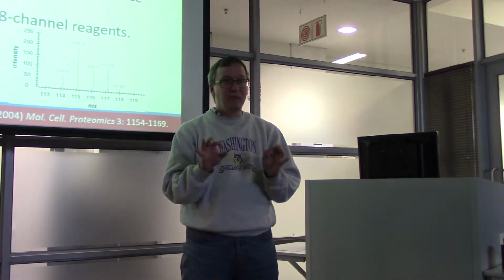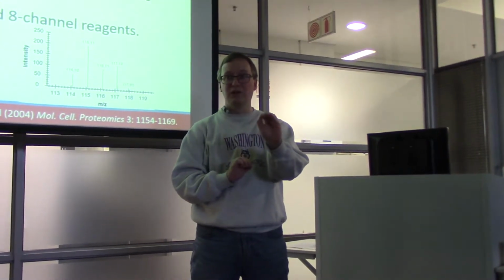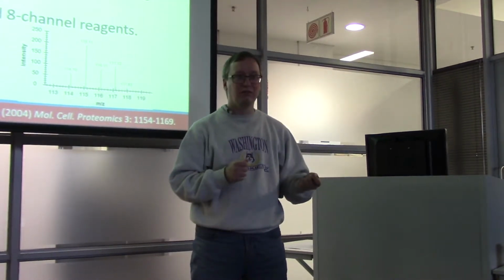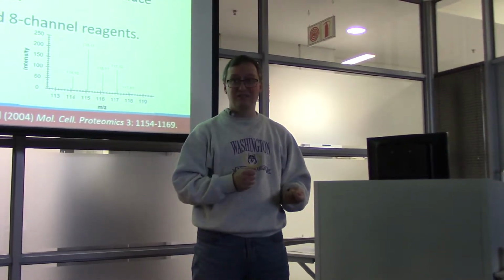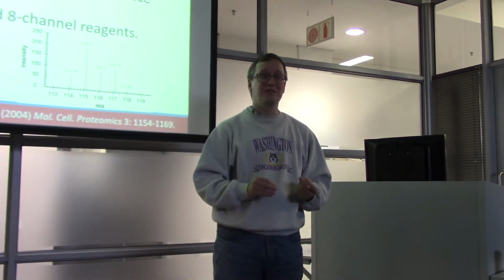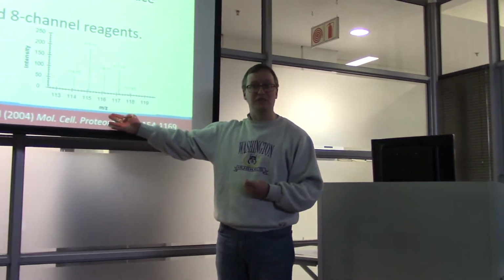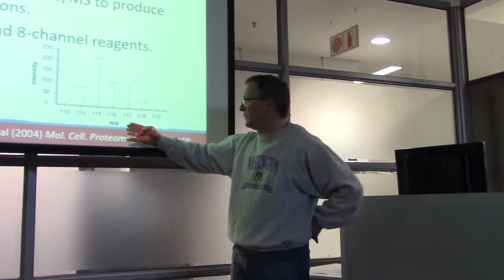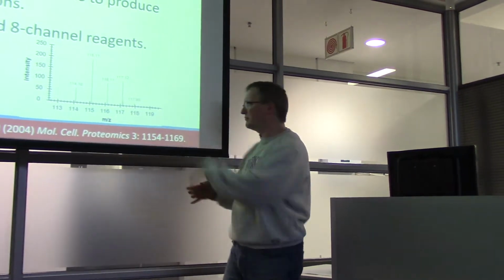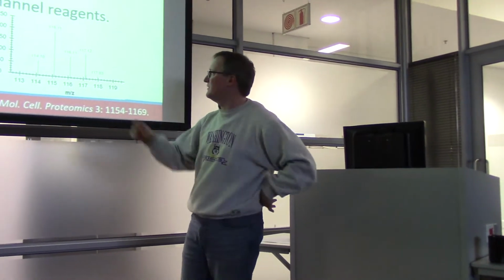Here's the magical bit. After doing an iTRAQ experiment from an individual tandem mass spectrum, you can ask, how much of this peptide came from which cohort? Does everyone get that? I realize a lot of this is really complex, so I hope you'll bear with me on this. When you have a tandem mass spectrum produced in an isobaric reagent experiment, in an iTRAQ experiment or a TMT experiment, you can look at this low mass region of the tandem mass spectrum. Up above this, we've got all kinds of B ions and Y ions going on. That's the same in all kinds of tandem mass spectrometry.